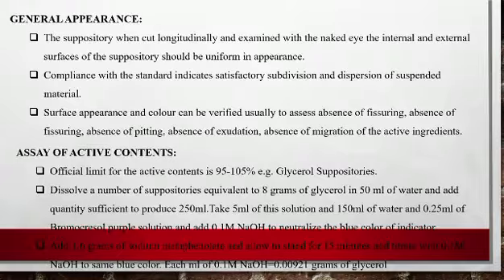First, we have to check the appearance and color. Mainly, we have to verify that the suppositories show no pitting, no exudation, and no migration of active ingredients.